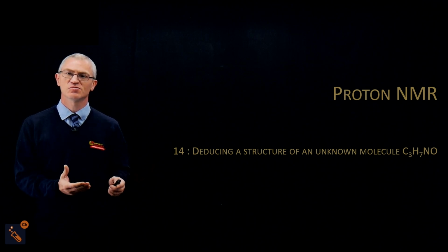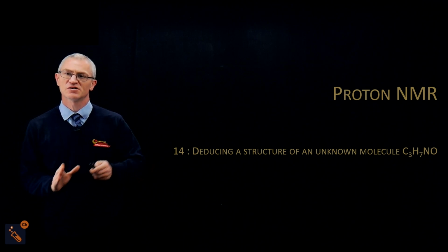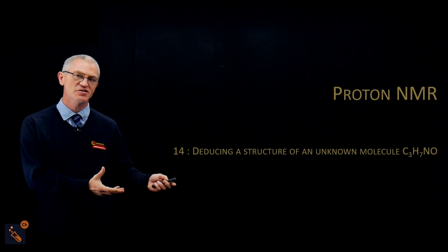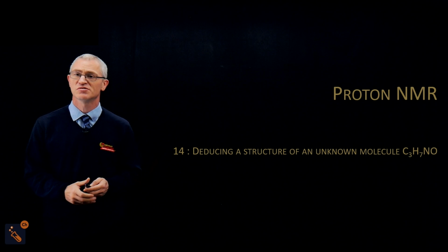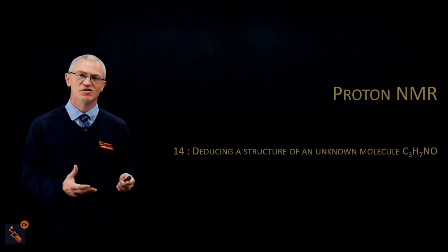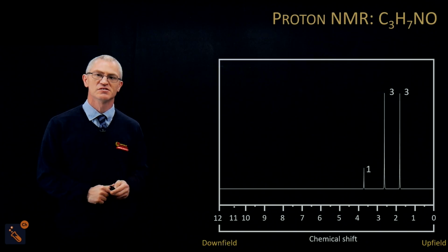This is the final one of the videos where we go through functional groups and lessons. There is a further video on what happens if you add deuterium oxide that follows this. But let's get on with the functional group we're doing today.